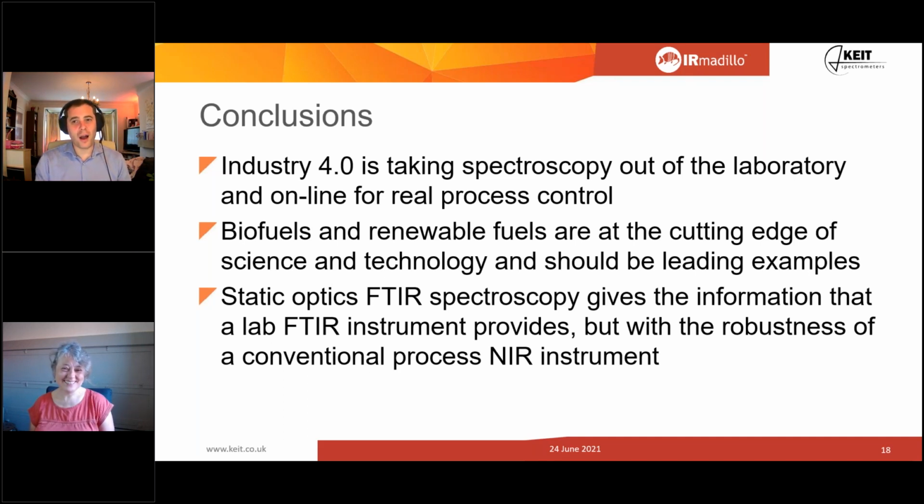And that's a combination of things. It's got a very high extinction coefficient, so the spectrum is very strong for that molecule. Their reference data is top notch. One of the things that compound your errors is an error in reference data. So if your titration is a bit erroneous, or your HPLC hasn't been calibrated very well, that error compounds the detection limit in the spectrometer. Their reference data is fantastic, and we're looking at a very narrow range of low concentrations. So in that case, we've done ppb. I wouldn't promise that for everyone, but ppm I'm comfortable saying we can almost certainly do.